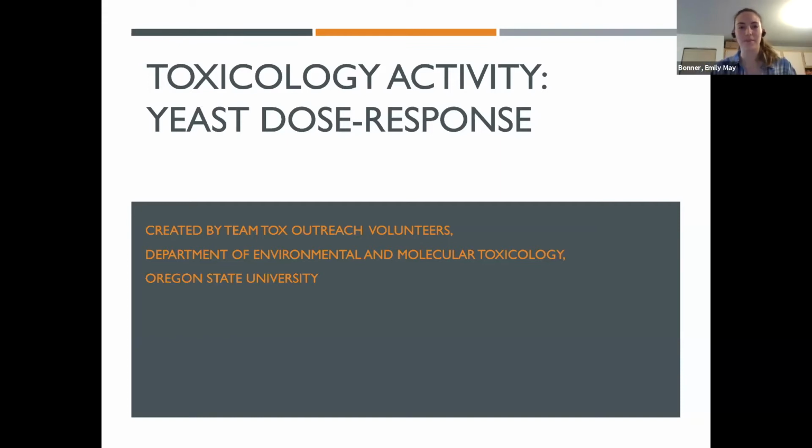We are from Team Tox, an organization in the toxicology department at Oregon State University. Today we'll be walking you through a science experiment based on yeast dose response. And all of that might sound like nonsense right now, but hopefully by the end of the activity, you'll understand what all those words mean.